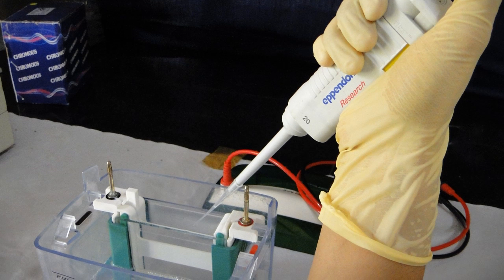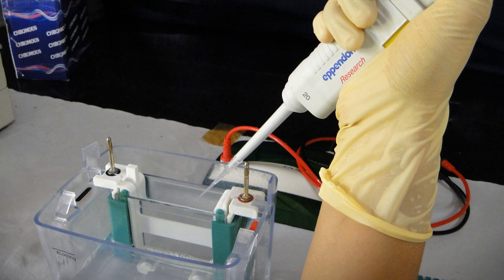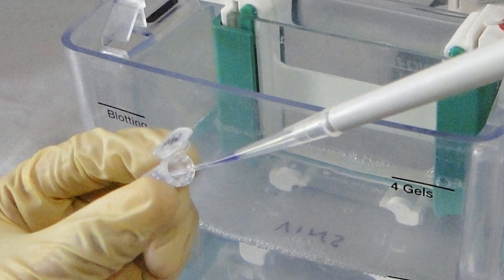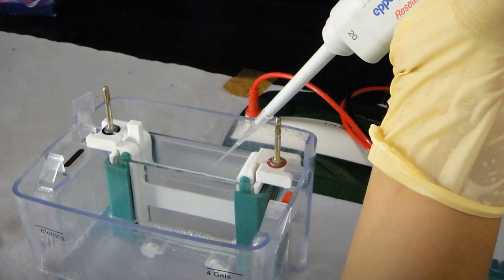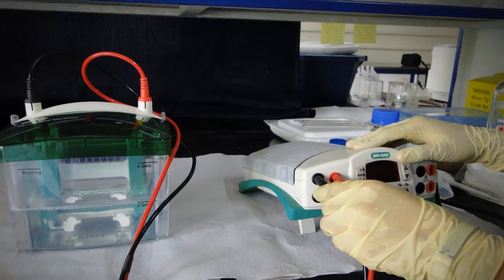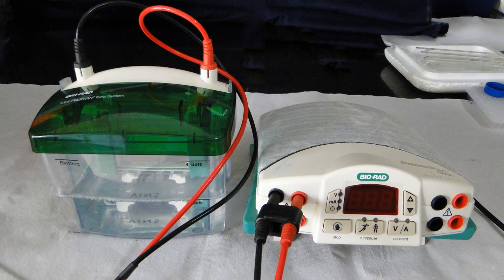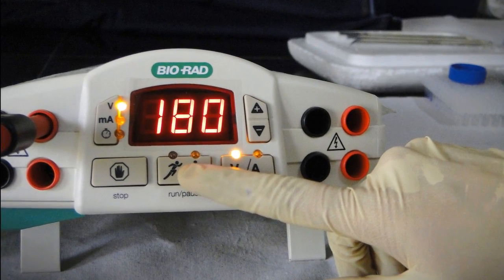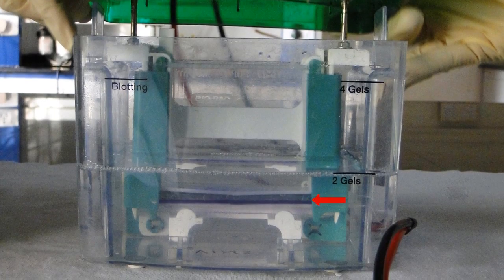Rinse the loading tip a few times with buffer. Make sure that all the buffer is pipetted out before loading the samples. Insert the loading tip a few millimeters from the well bottom and deliver the samples into the well. Rinse the syringe a few times with buffer after loading. Attach the power supply by closing the lid. Make sure that the connection is correct — black to black and red to red. Set the voltage to 180 V and run for one hour. Do not allow the dye front to go out of the gel.